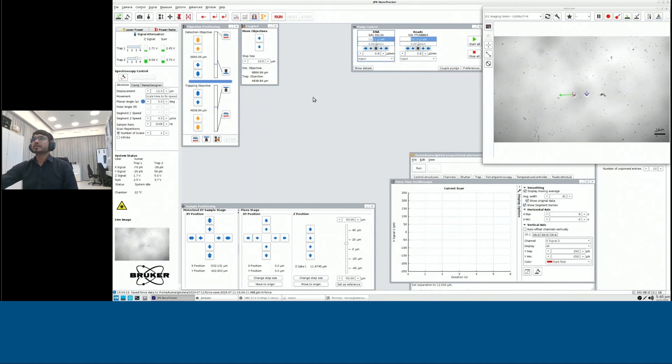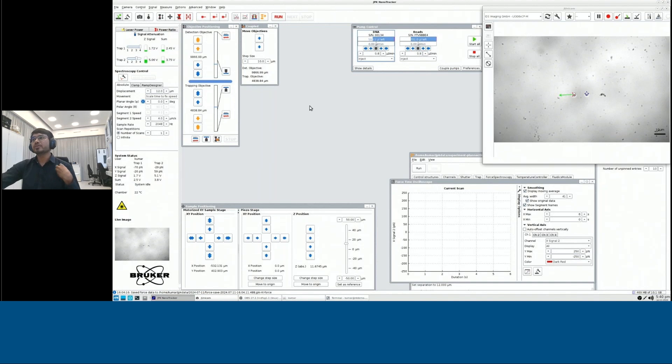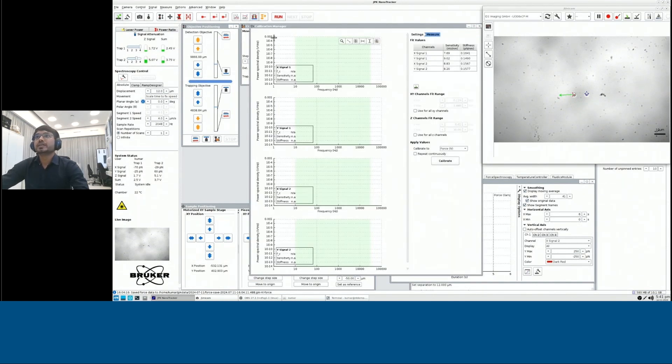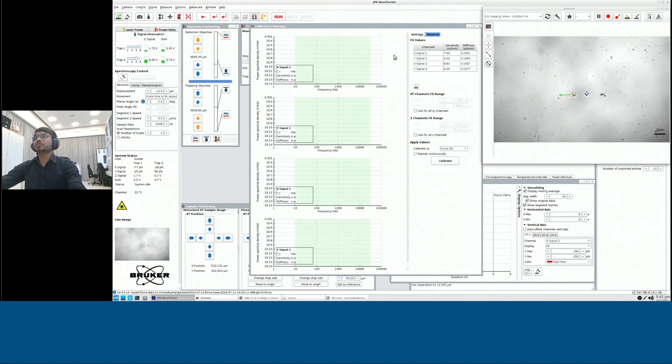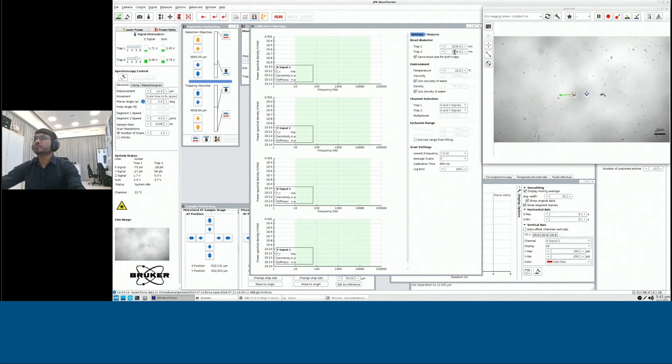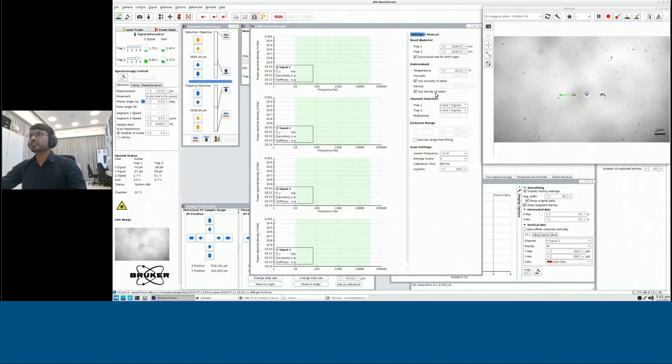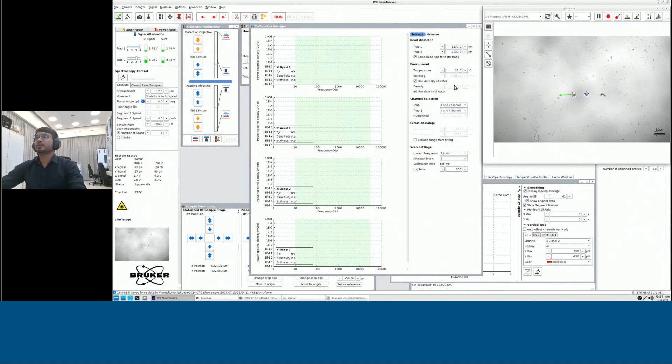But before that, for the people who are not aware, before measuring the forces, you need to calibrate your optical tweezers. To calibrate optical tweezers, we use power spectrometry. You could set up the diameter of the particle that you are using, temperature, as well as the density and the viscosity of the medium in which the beads are trapped.